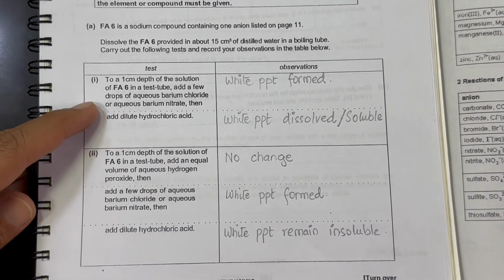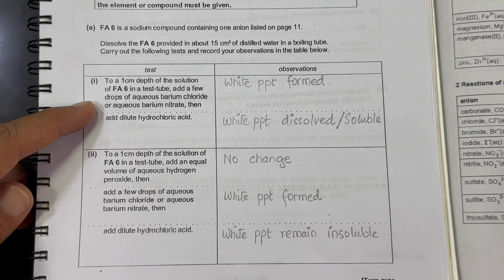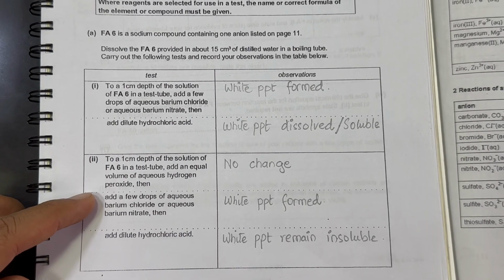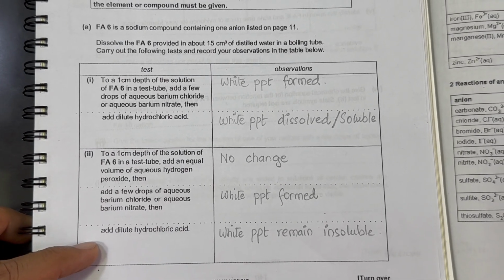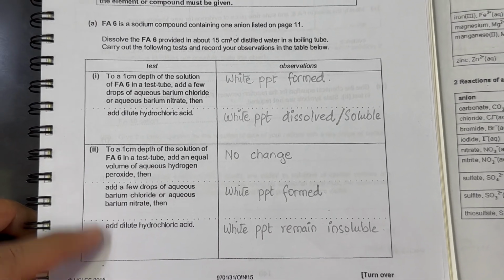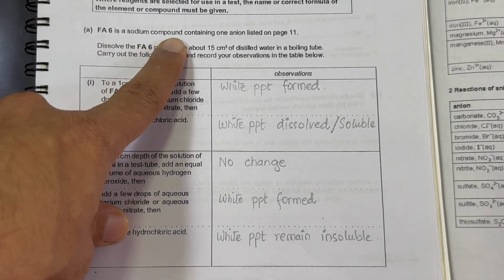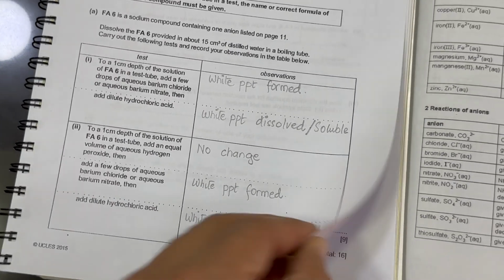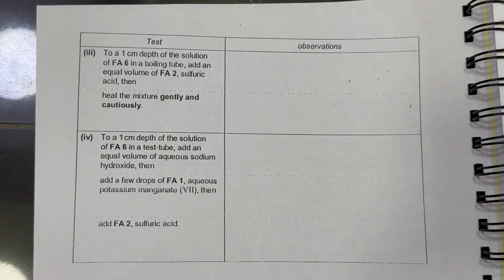In this test it is confirmed, and now we have confirmed it again by adding hydrogen peroxide so that it is oxidized and forms sulfate, and the white precipitates of barium sulfate remain insoluble in acid, which means Fa6 was sodium sulfite.